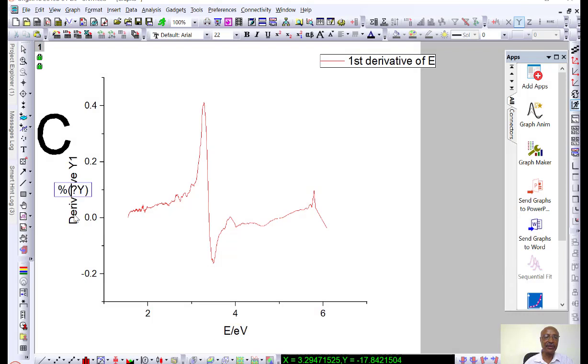Let me change this. This is dA over dE, the derivative with respect to energy.